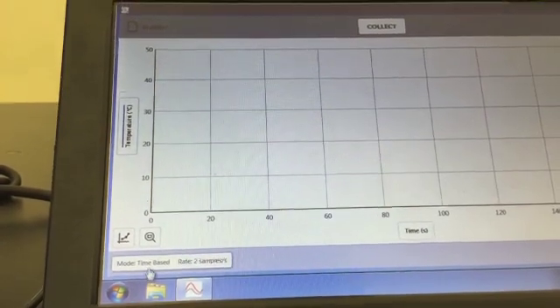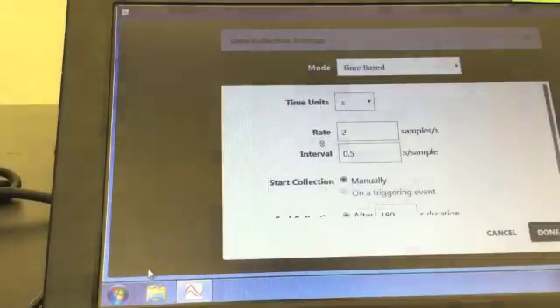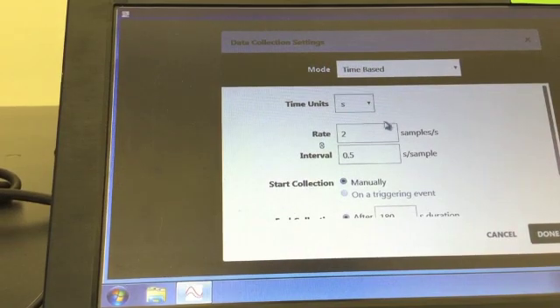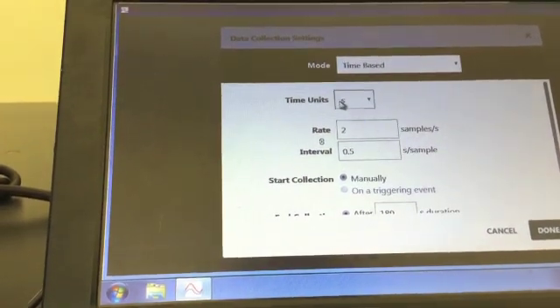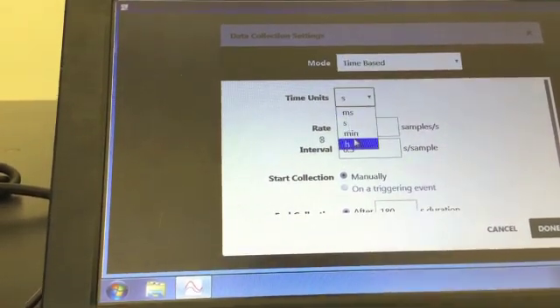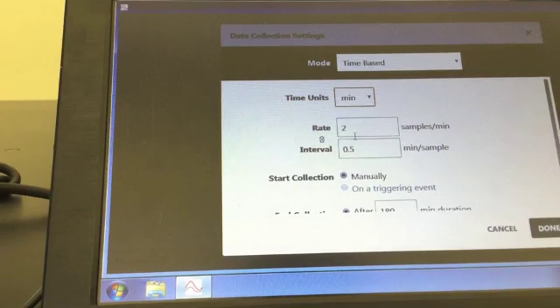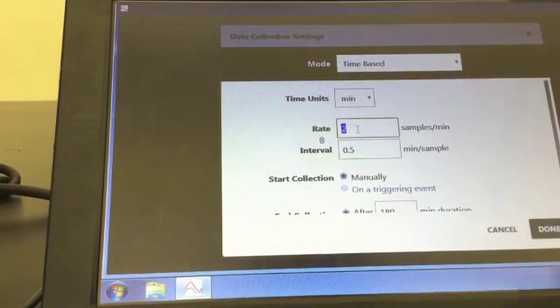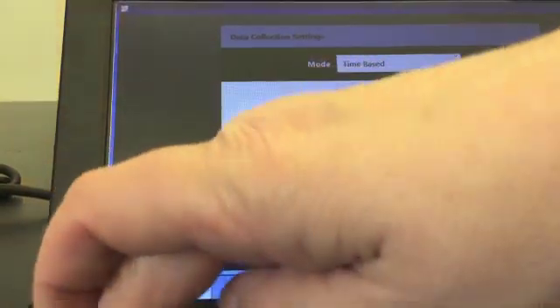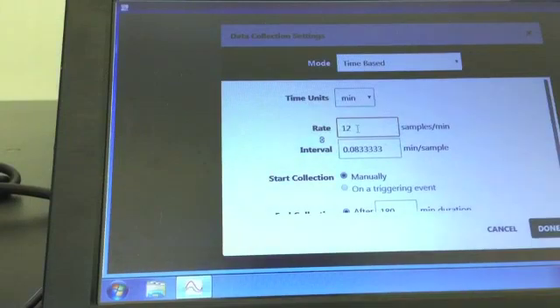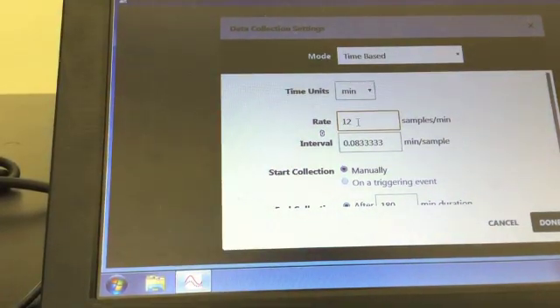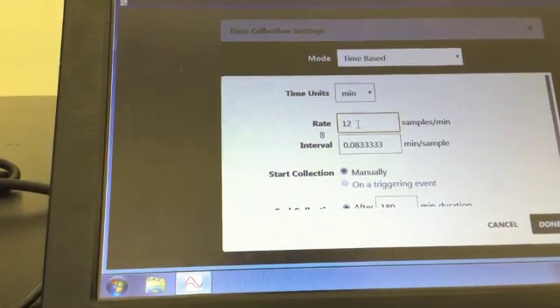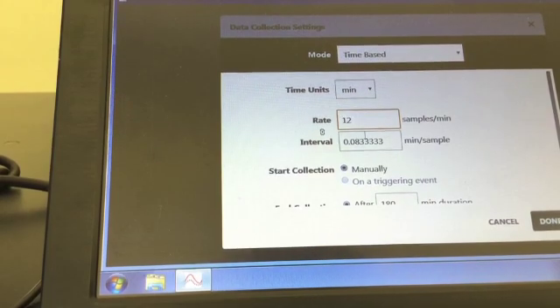Click on the mode at the bottom of the screen and select time-based. Set your time units to minutes and have the computer collect 12 samples per minute. This is roughly once every five seconds.